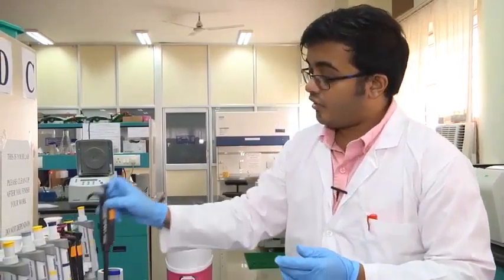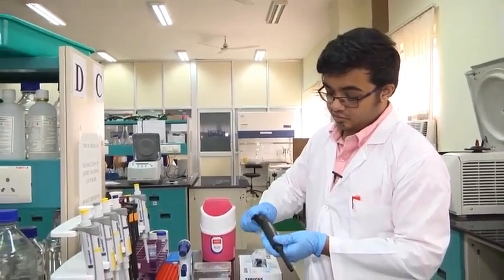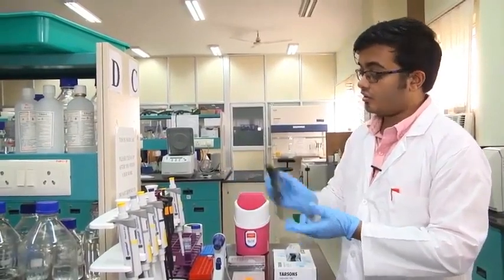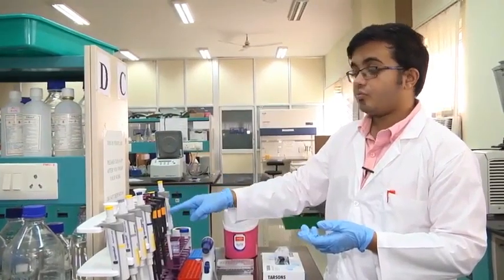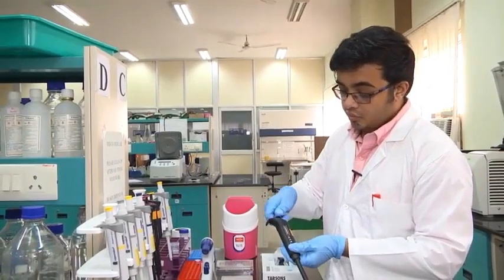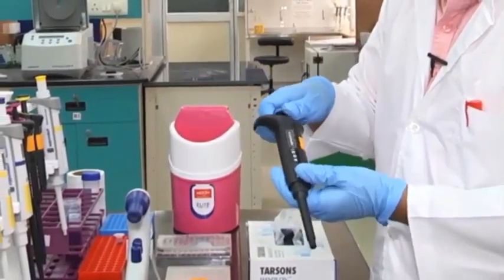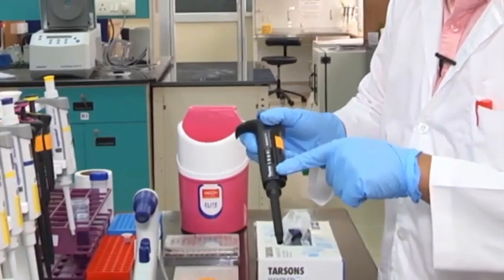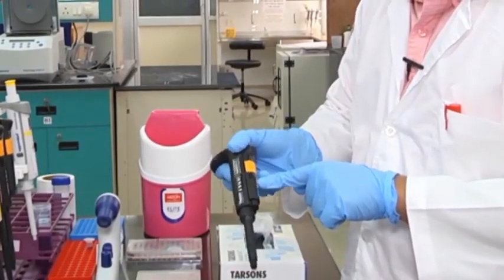Another thing is, after you have finished using your pipette, suppose you had used it at 800 microliters. You needed 800 microliters of that solution and you collected it. Do not leave it like this, because that will damage the internal spring mechanism that is present in this instrument. When you are done working with the pipette, always keep it in its released condition. The released condition corresponds to the maximum volume that can be pipetted with that instrument. In this case, 1000 microliters is the maximum volume that we can collect.